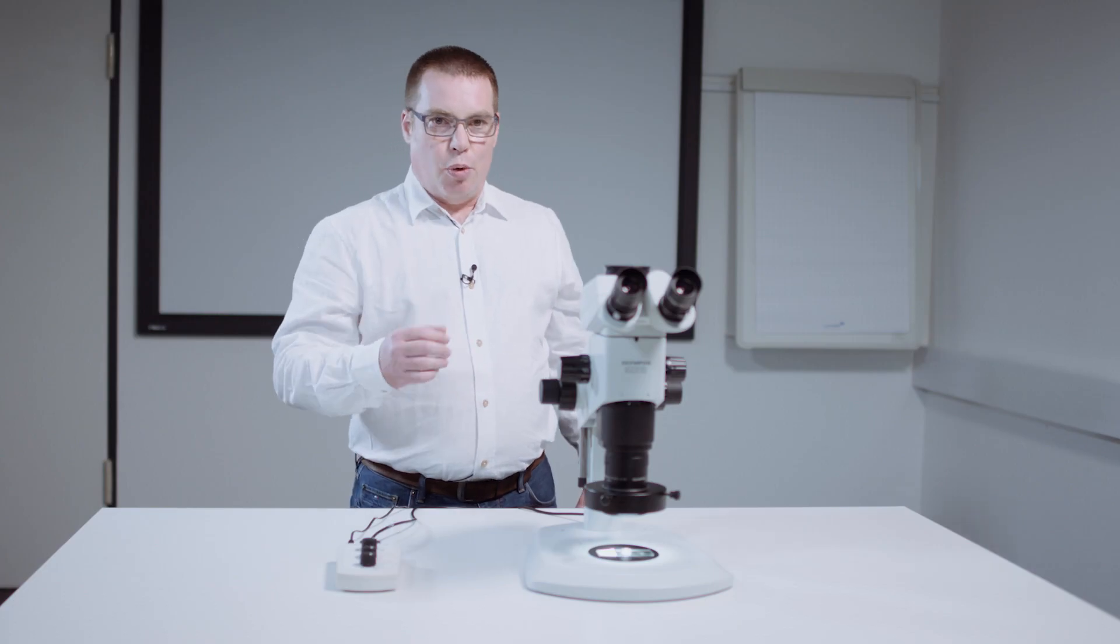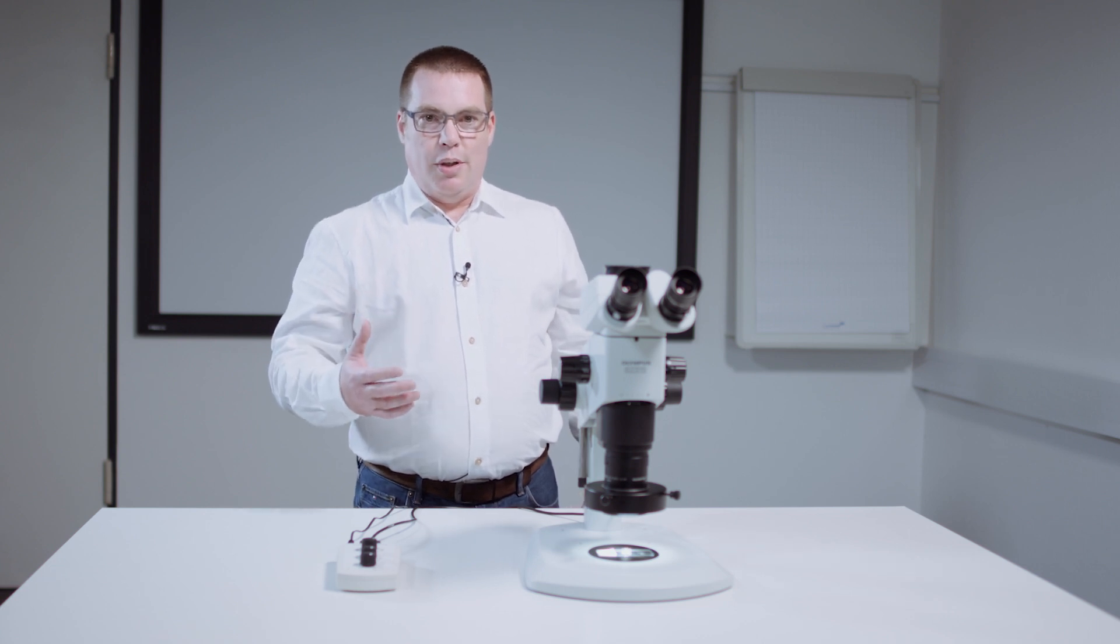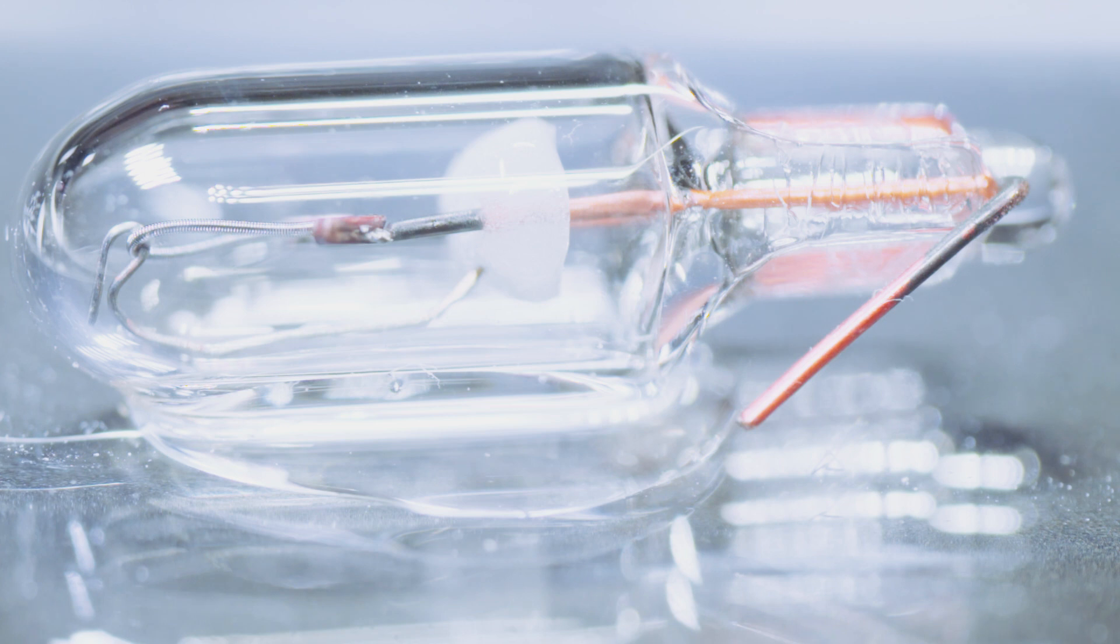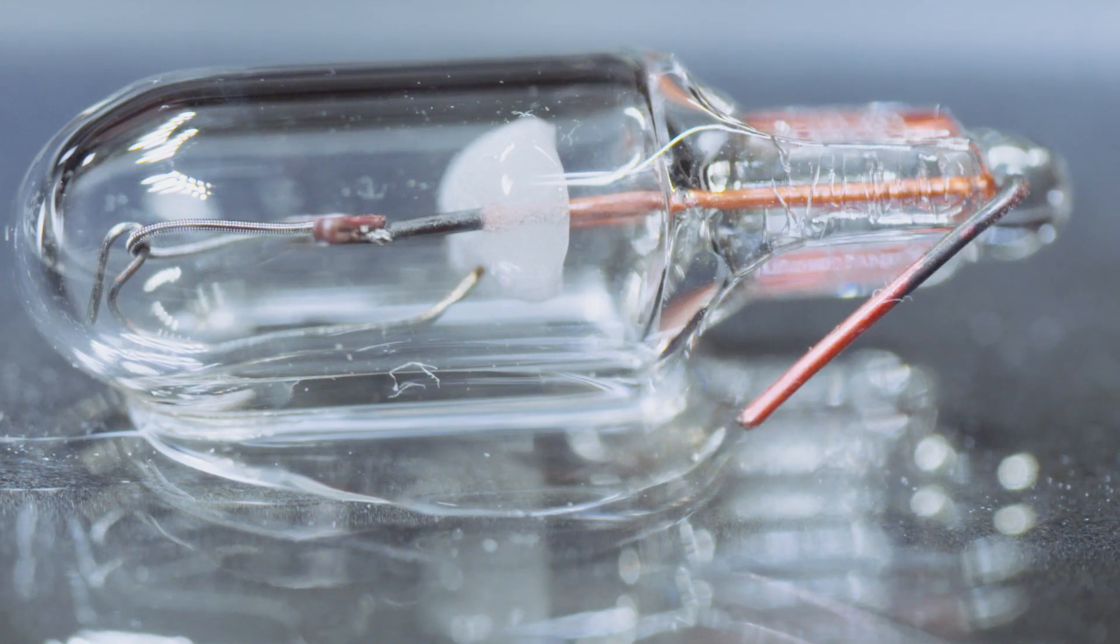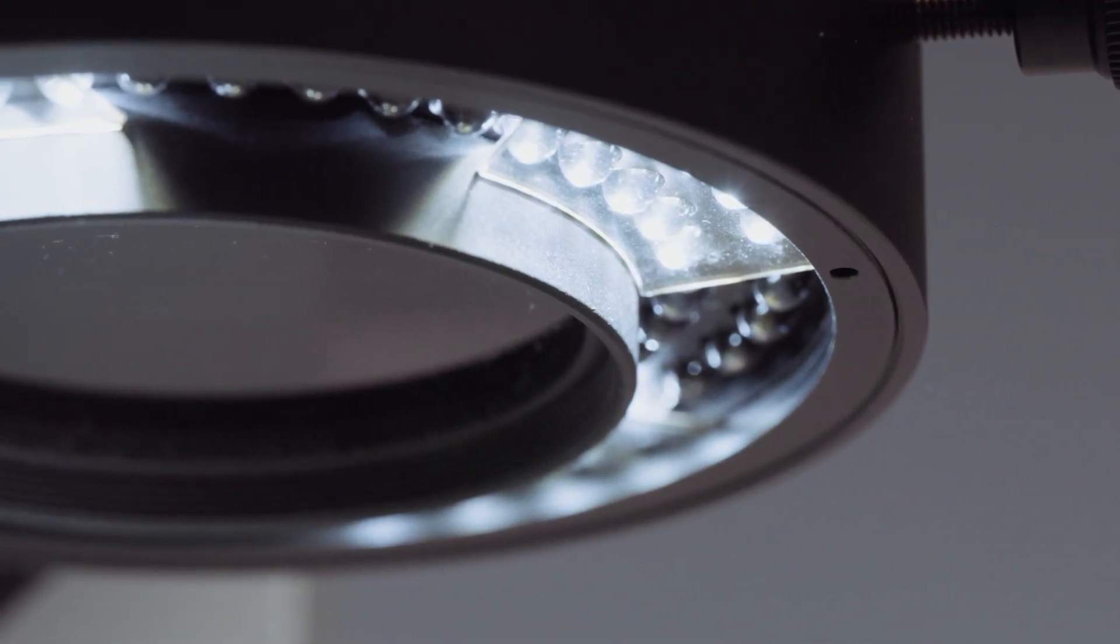The segmented pole set can be used for all processes in which the sample must be inspected both in Bright Field and in Polarization. The segmented pole set is the solution of choice, especially where an automatic change between these two observation methods is required.